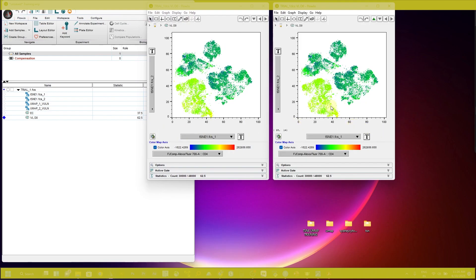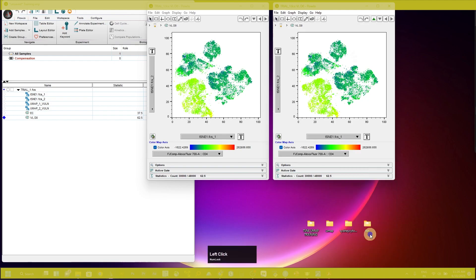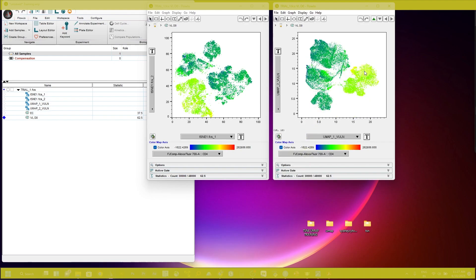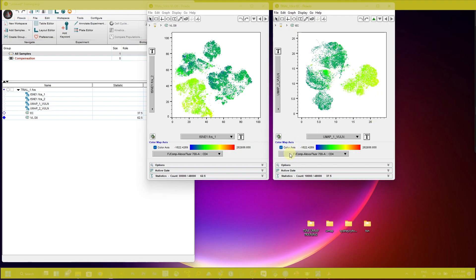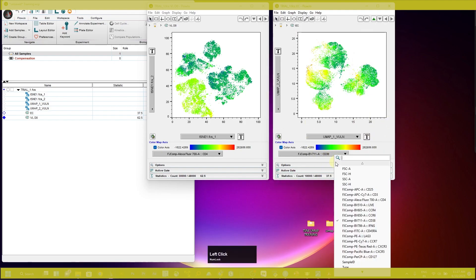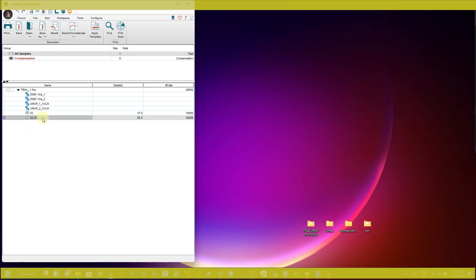If you want to see the UMAP — I ran both t-SNE and UMAP analysis on the same data — go to the axis and change it to UMAP1 on x-axis and UMAP2 on y-axis. You can see the UMAP plot. Change the sample and you can see the CD4 expression on the EC group. To see the expression of other markers, just click here and select the marker of your interest.